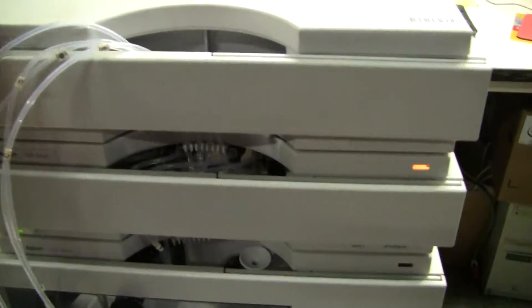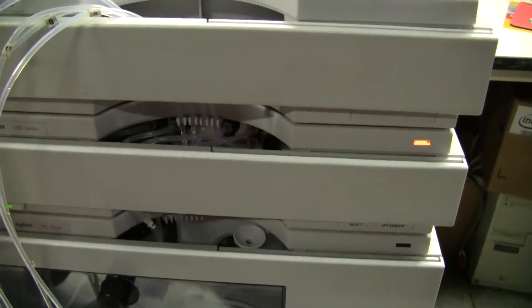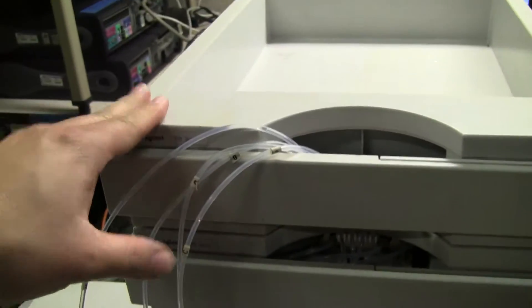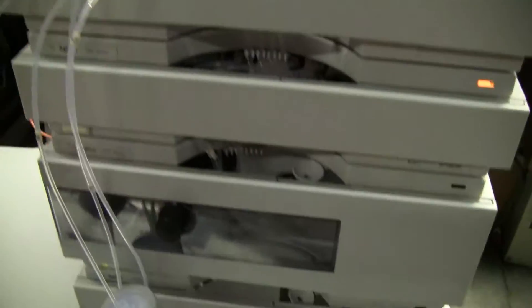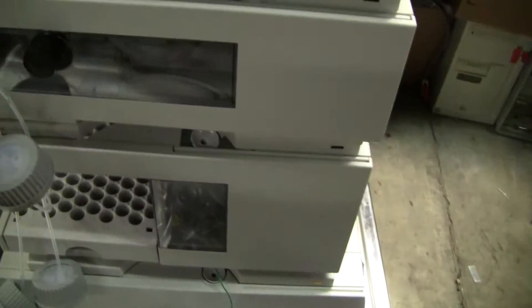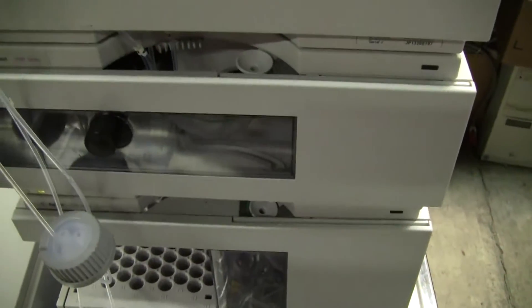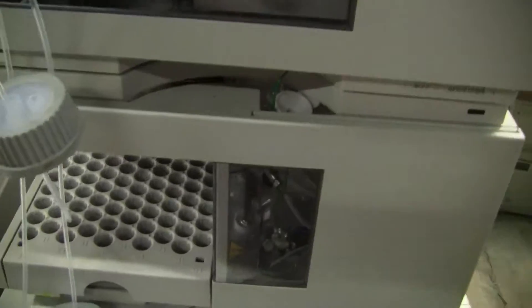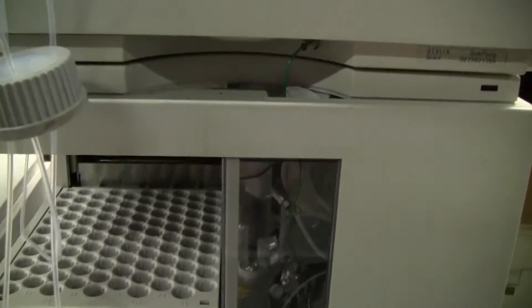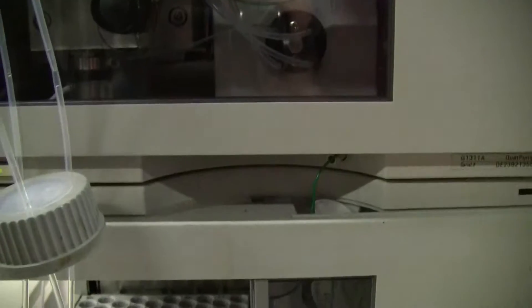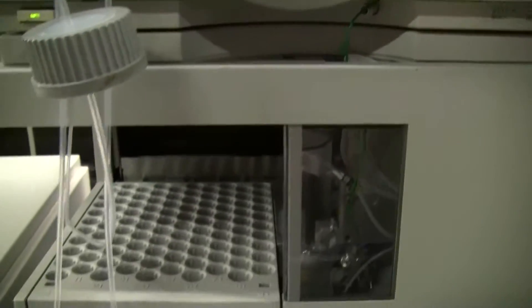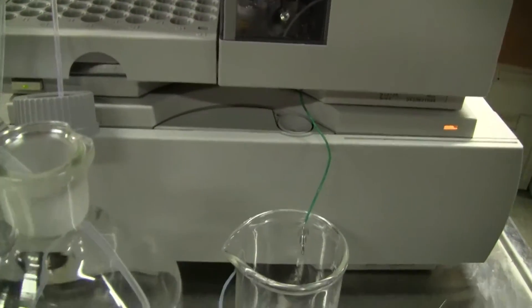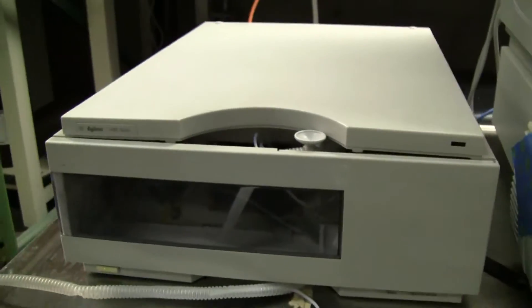The system contains a degasser, column tray, quad pump, auto sampler, column heater, and a DAD detector.